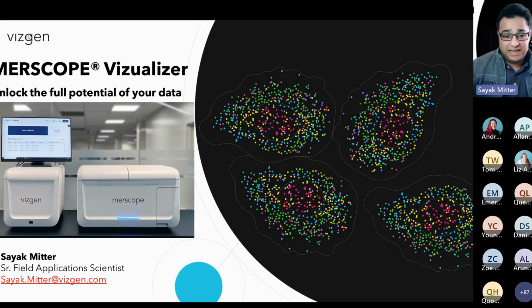Before I begin a demonstration of the visualizer, I'd like to mention that the visualizer software comes free of any licenses, which means that once you have MERSCOPE data and you want to look at the data, the visualizer is made available to you in both the Windows and the Macintosh environments that you can install on your computers and open the MERSCOPE visualizer related data on your systems.